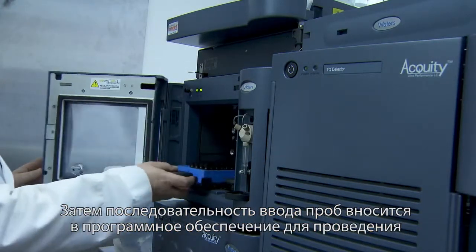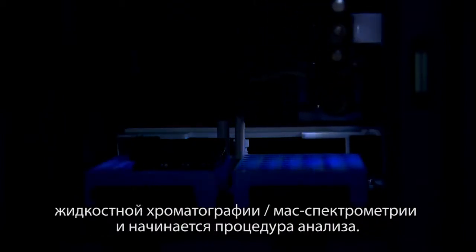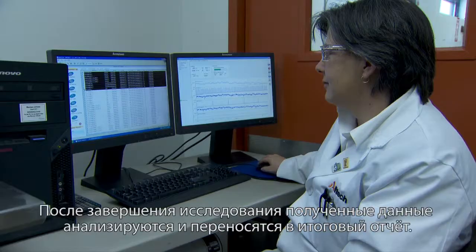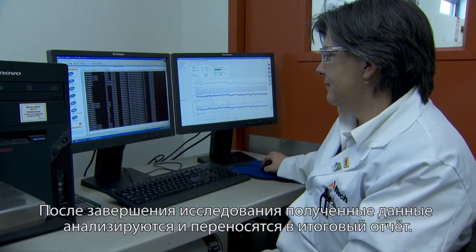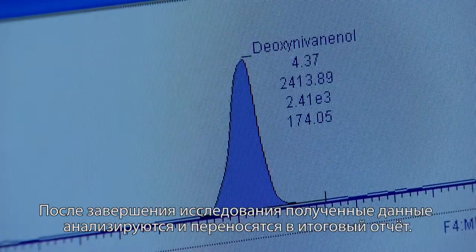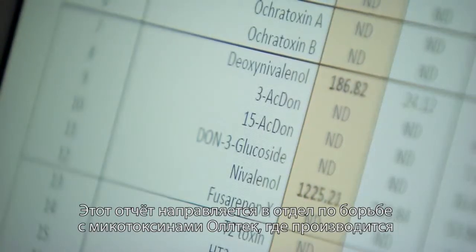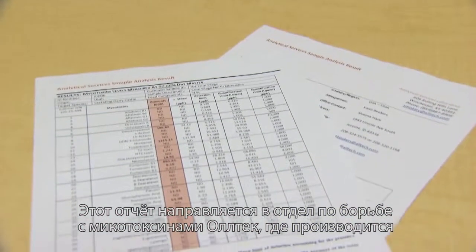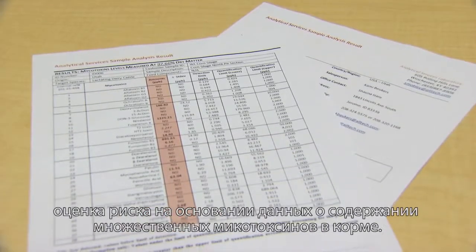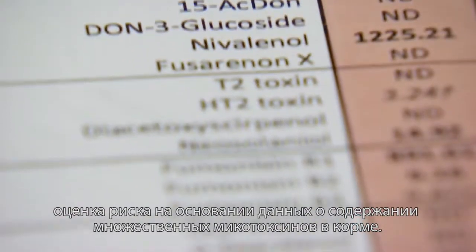The sample sequence is then programmed into the LC-MS and the injection sequence begins. Once the sampling sequence is complete, the raw data is reviewed and transferred into a data report. This report is passed on to Alltech's mycotoxin management team of specialist researchers, where they assess the risk posed by any multiple mycotoxin contamination found in the sample.